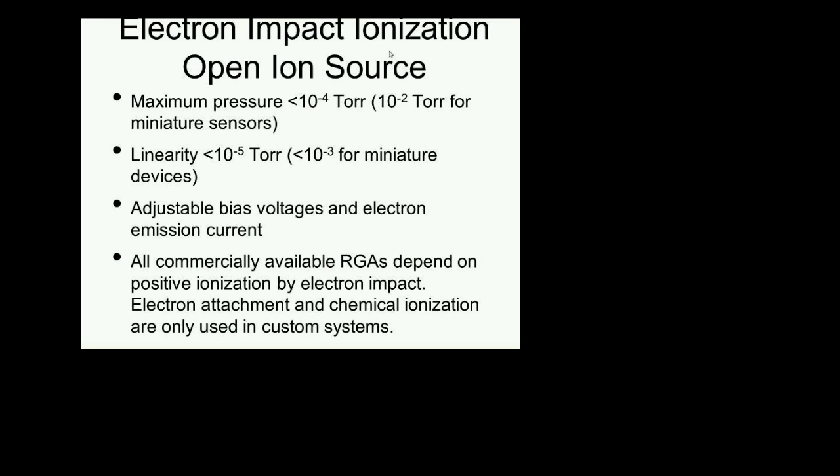And that's the last thing that I wanted to touch on, which is one of the things that you can change in all ionizers: the emission current. I get a lot of questions: should I operate at the default value or should I change it? This is my recommendation as far as the emission current setting for the ionizer. For most applications, the value that is provided by the vendor is the one that you want, to make sure that the unit performs over its entire range of operation.